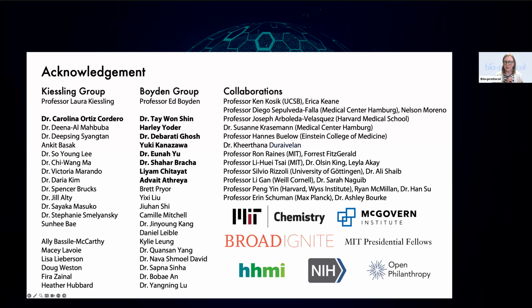There are a couple of questions about transferring it into different tissues. So is it possible to observe collagen architectural patterns in human tissue samples? We haven't tested this gel with human tissues extensively. It's certainly possible, but with human tissue, I would recommend referring to the expansion pathology paper that we previously did. I think it depends on how the tissue is preserved, the tissue quality, and a lot of other factors. But definitely happy to chat more if you want to optimize that.